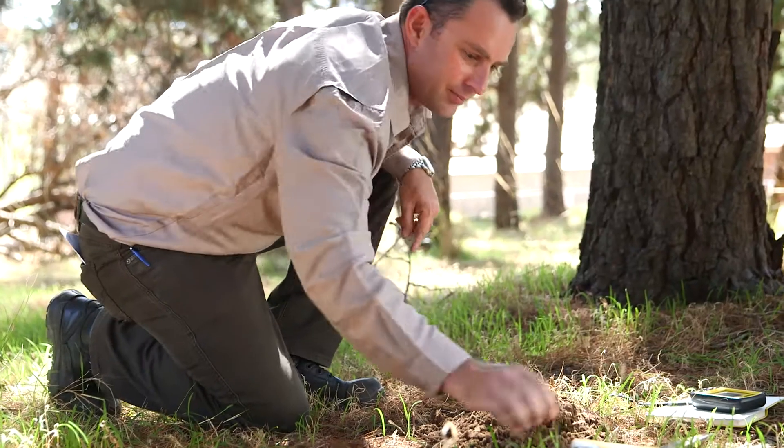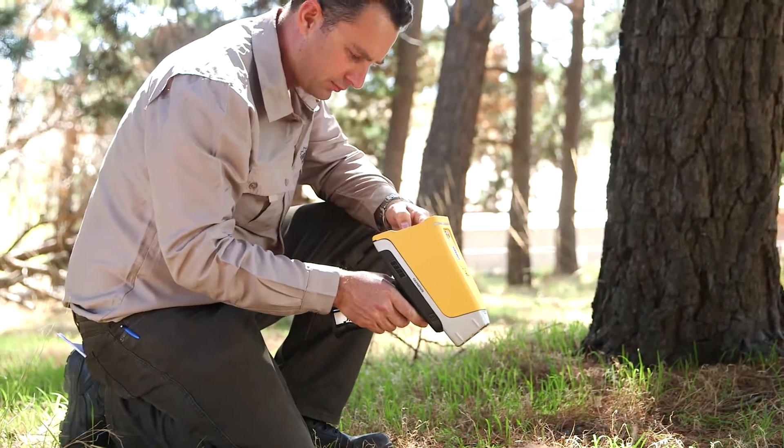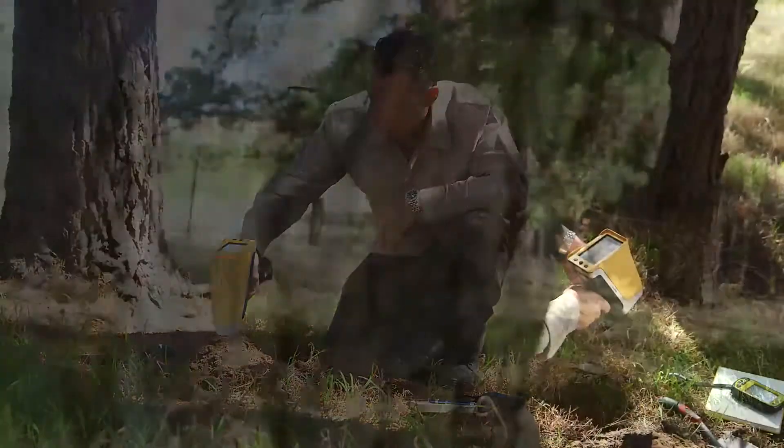They sieve it, analyze it, and move on to the next point. The portable XRF provides the customer a great, fast tool to get through these large-sized grids very quickly.